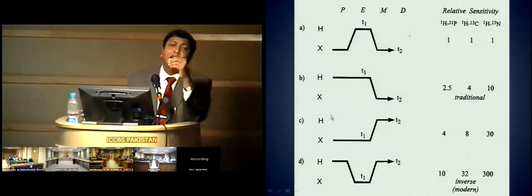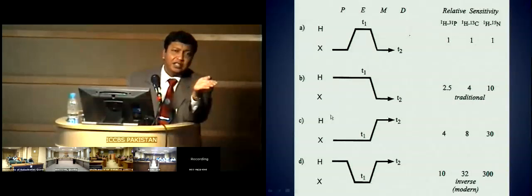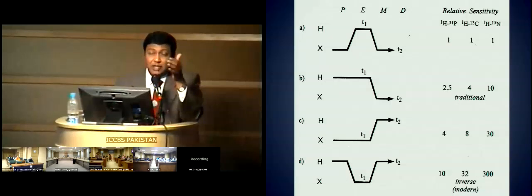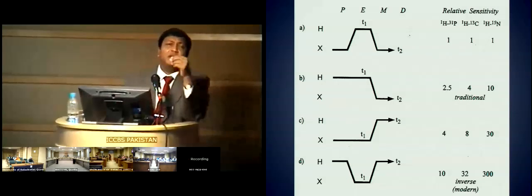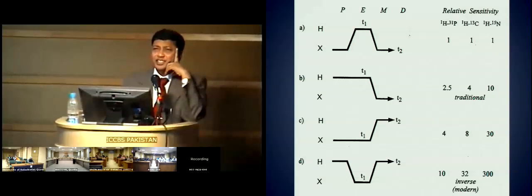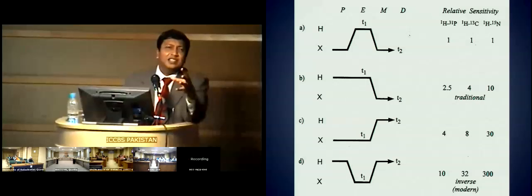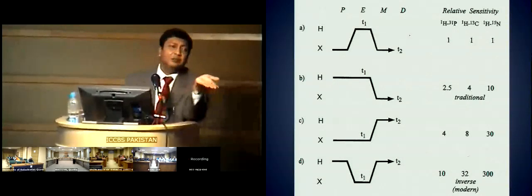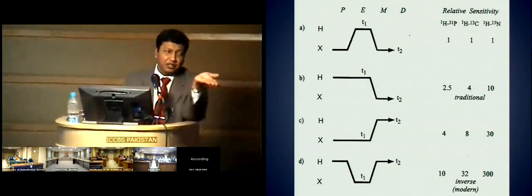That is the reason. Now, there is a sensitivity decrease, as you said, which is fine. But this sensitivity decrease is in a proton NMR spectrum. And remember, a proton NMR spectrum, even in the worst case, would always be more sensitive than a carbon-13 NMR spectrum. Okay?